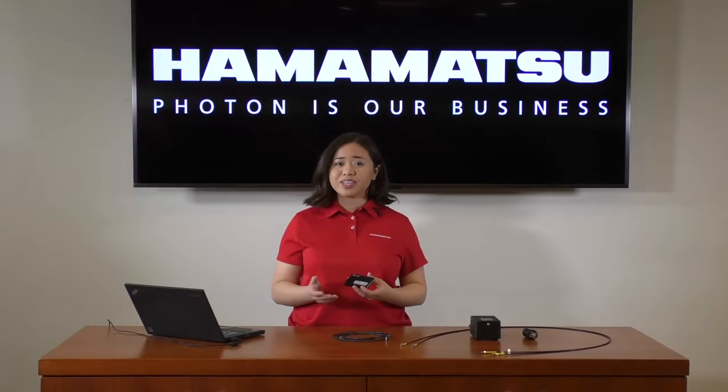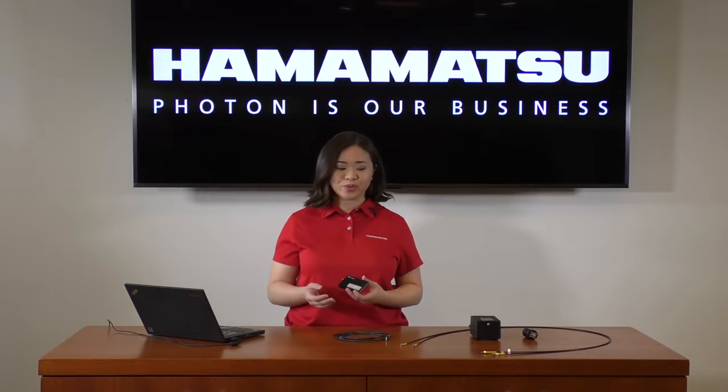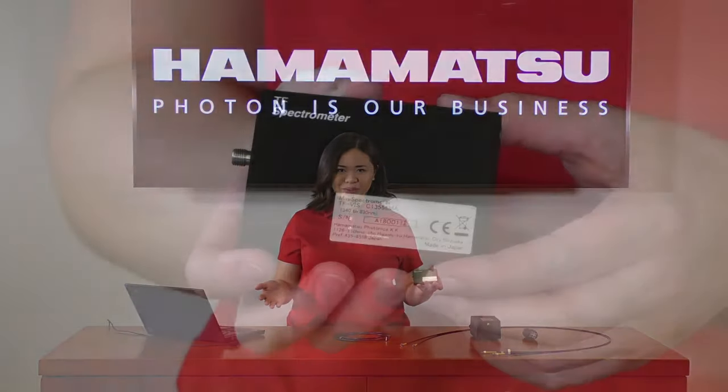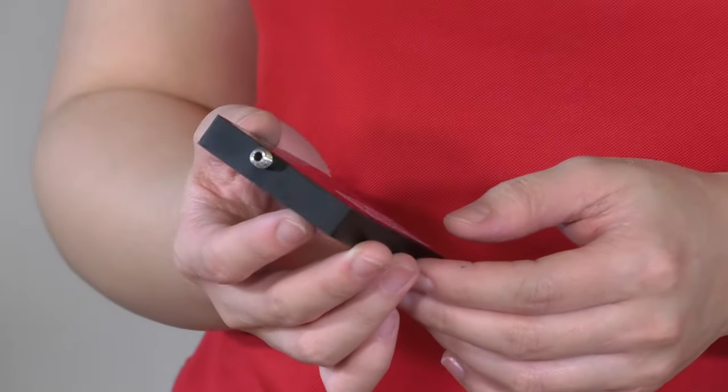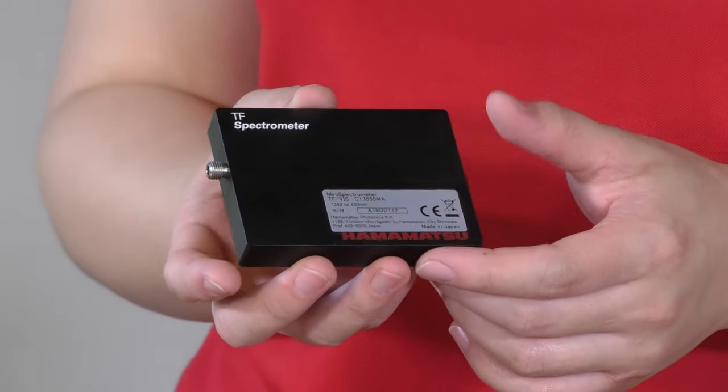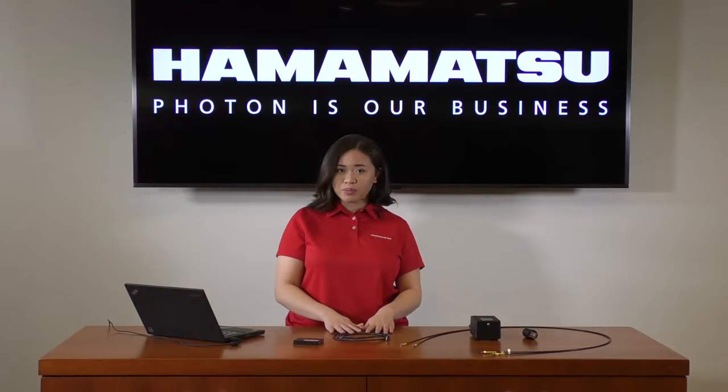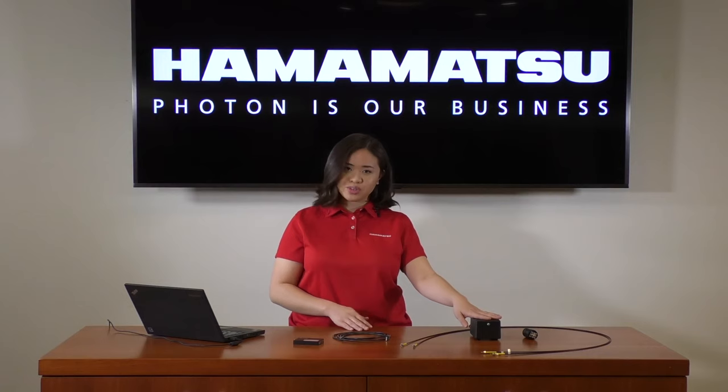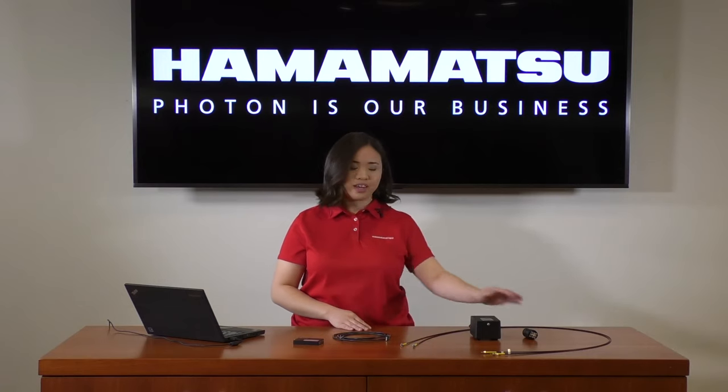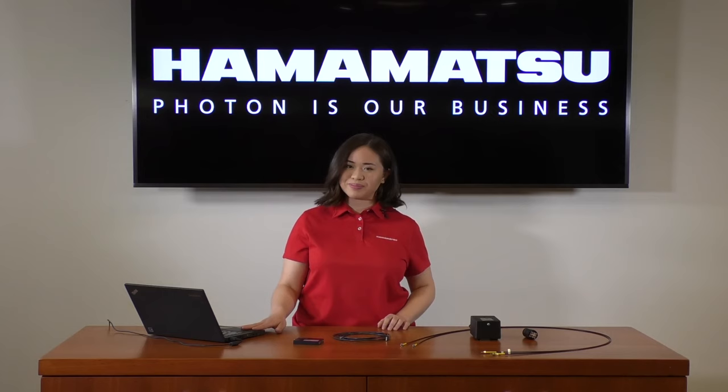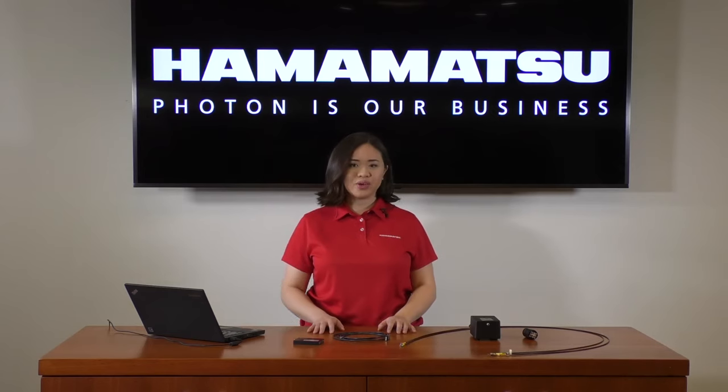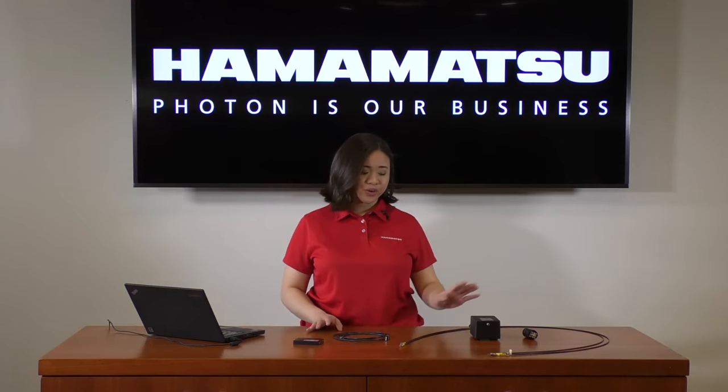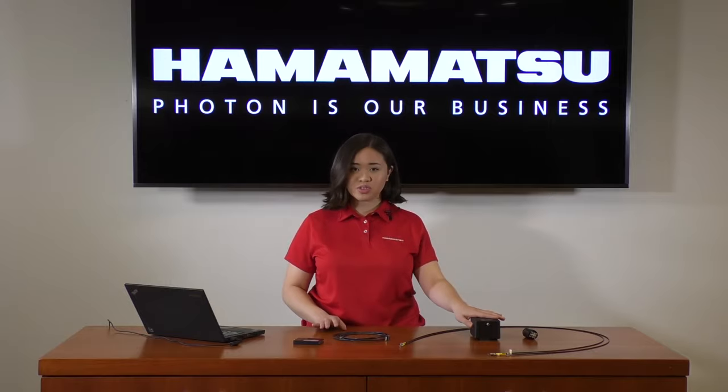To give you some idea of how to test the spectrometer, we've assembled an example test setup. So shown here is the C13555MA. Then we have a USB cable, a halogen light source, two fiber optic cables, an iris, and a PC. We've had our light source plugged in and going through warm-up for about 30 minutes to ensure stable output.